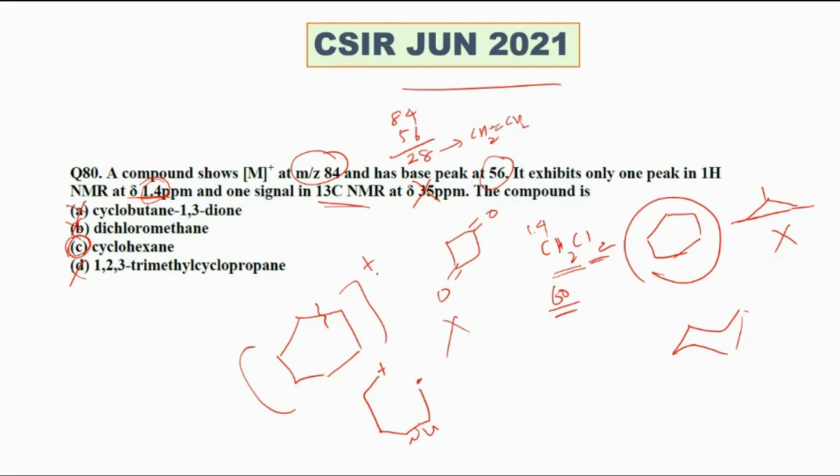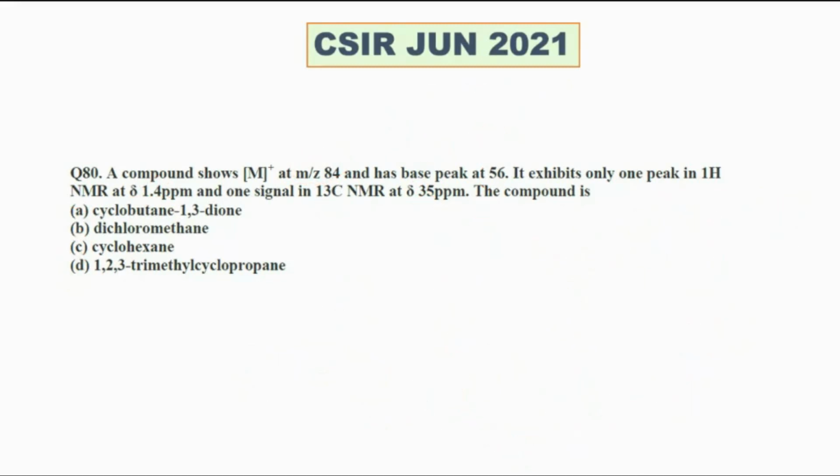So in the fragmentation pathway, you'll be having formation of plus dot plus CH2 double bond CH2. Neutral molecule will be invisible in mass. மாஸ்ல விசிபிள் ஆறது கேட்டியான் இல்ல ரேடிக்கல் கேட்டியான் மட்டும் தான். அப்ப இது மாஸ்ல தெரியாது. So this is having the value of 56. Suppose options are given very close, you can solve using mass, easily.